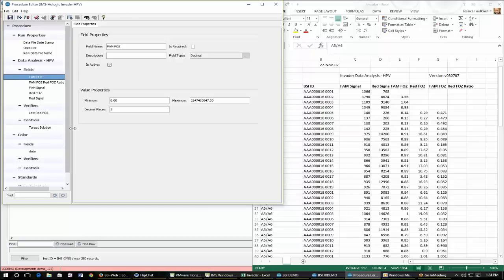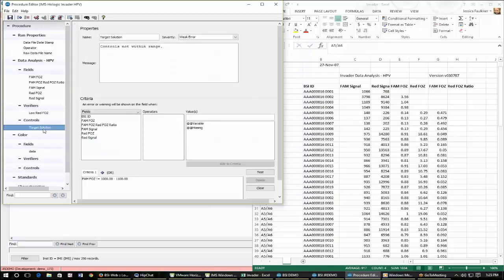Okay, so things that are unique to result batches, you can set up controls. A control is a verifier that would apply to a specific specimen, and when you are actually entering your results data or executing this in requisitions, you can specify which specimen that is. And the point would be to know if your data is valid based on expected information from this control specimen.